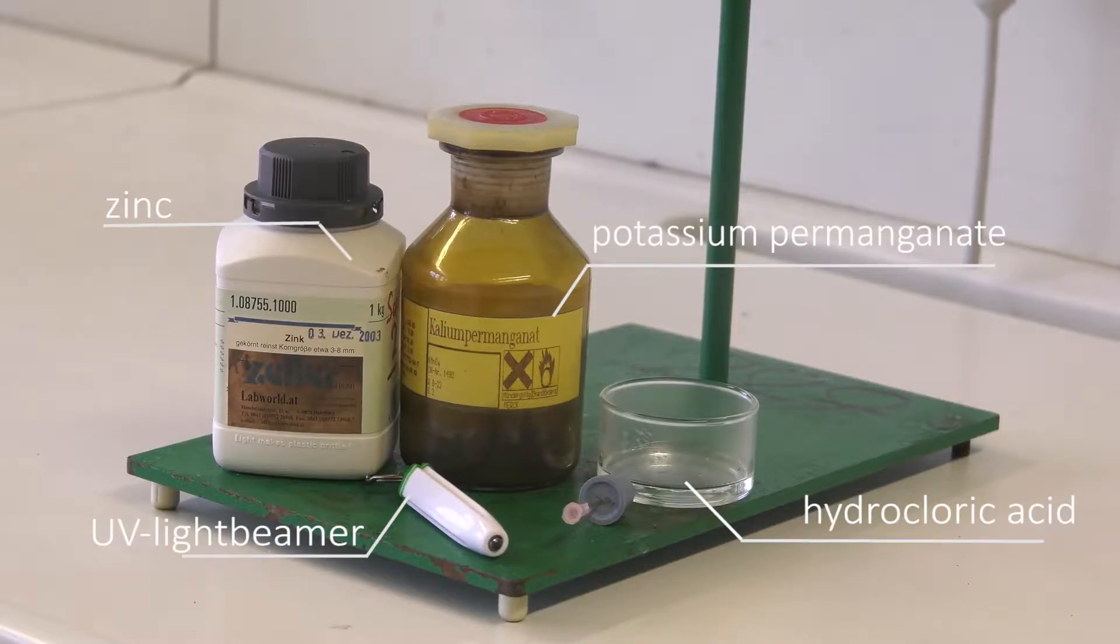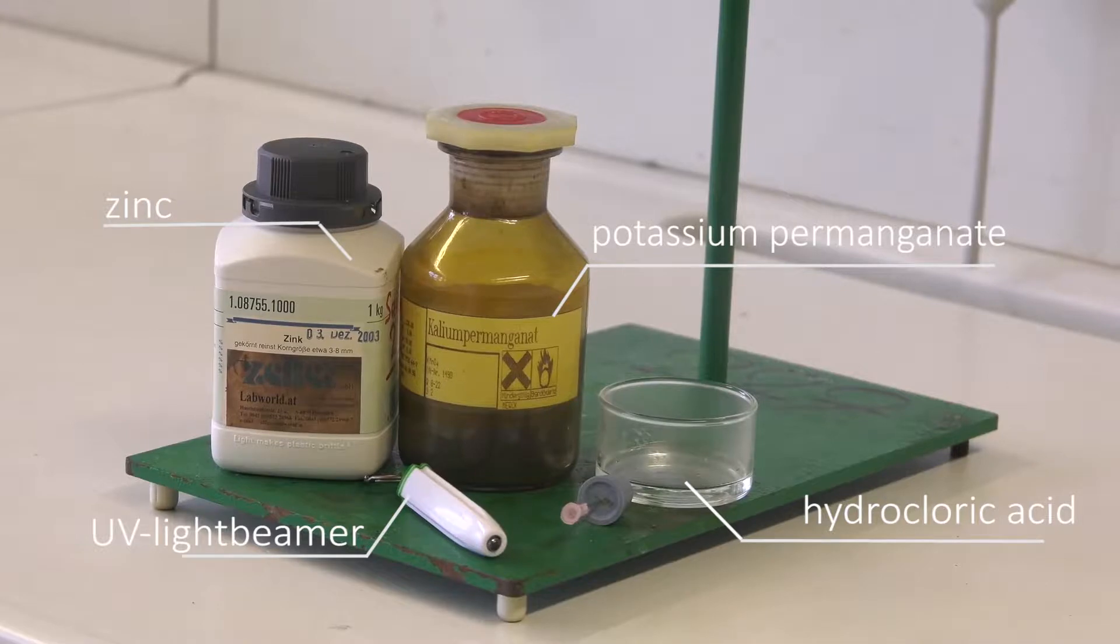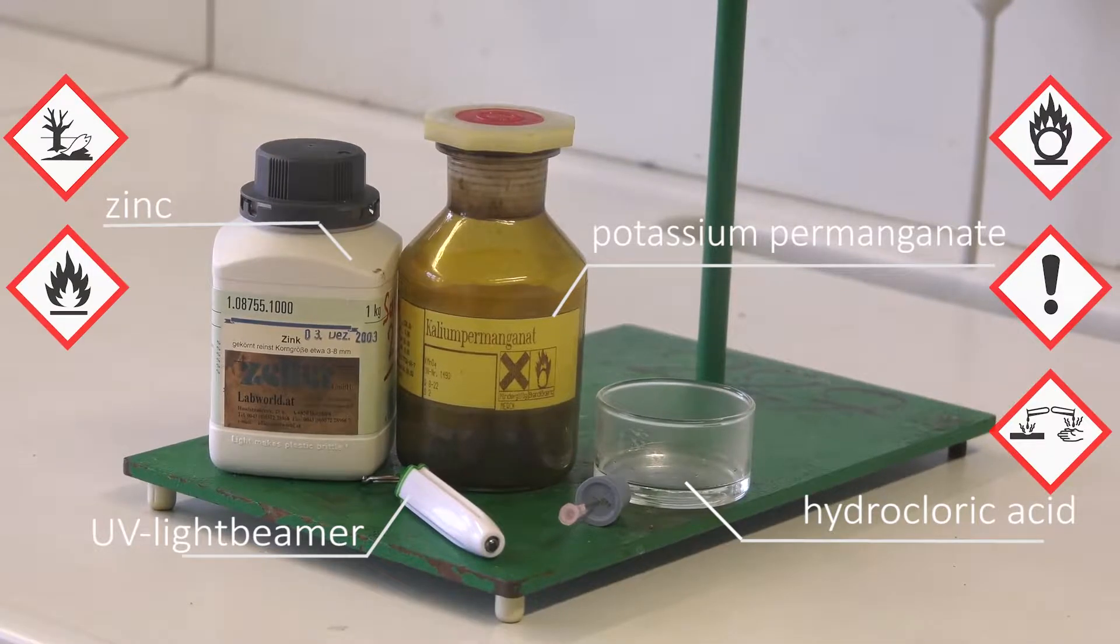For the reaction between chlorine and hydrogen we need zinc, hydrochloric acid, potassium permanganate and aluminium foil.